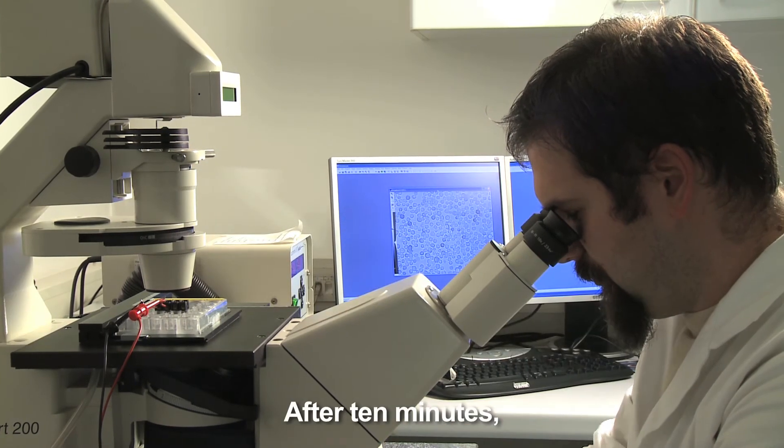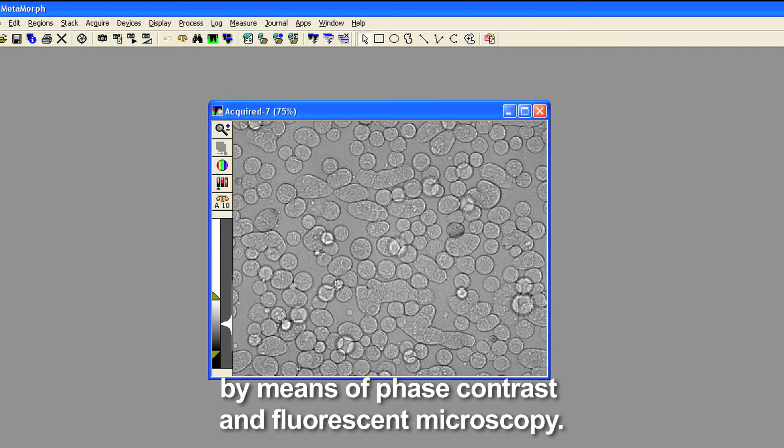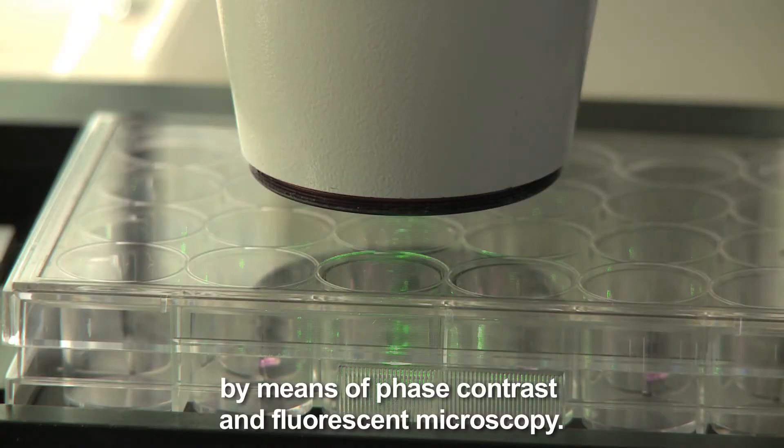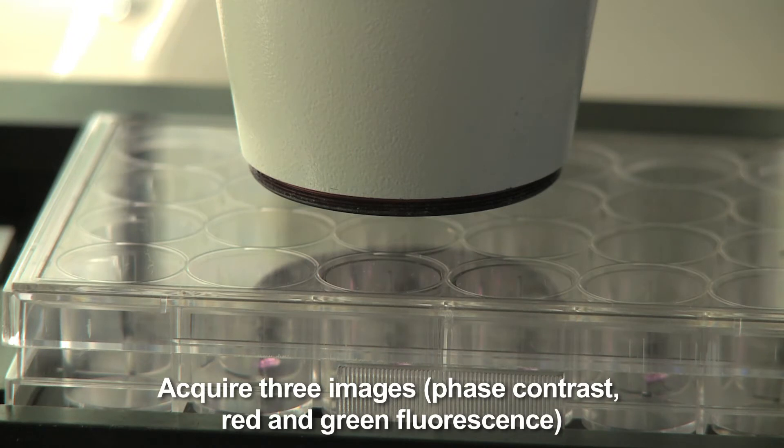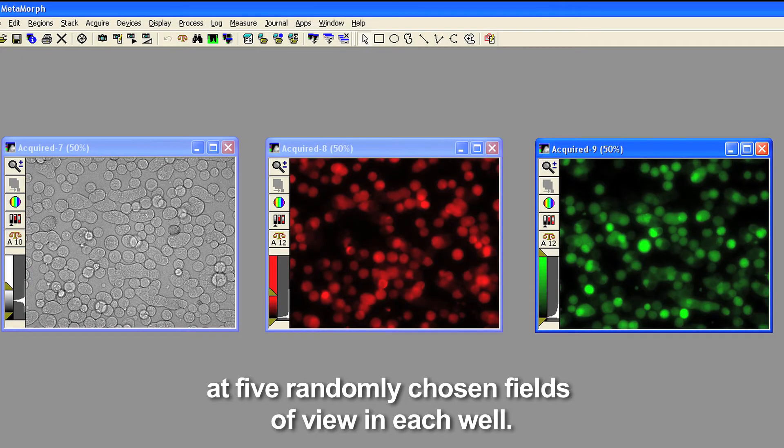After 10 minutes, determine fusion yield by means of phase contrast and fluorescent microscopy. Acquire three images: phase contrast, red and green fluorescence, at five randomly chosen fields of view in each well.